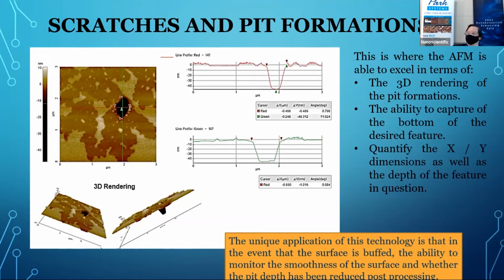I shall now attempt to buff this scratch away, meaning that I'll go in and polish it again. Then after that, when I come back, I need to quantify it. Has the depth of the scratch or pit become shallower after I've polished it?